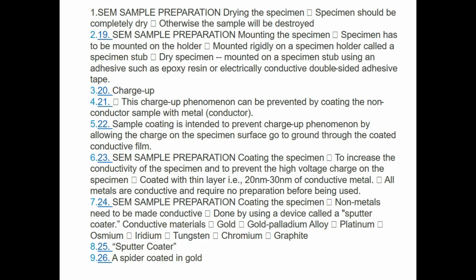Okay, and you can check what elements are placed inside that area, not an issue. Coming to biological samples and non-conductive elements, in biological samples it is very difficult. So what we have to do is give a coating, which is called sputtering. Most probably we use gold material to coat the biological samples so that the surface becomes conductive. By using that only we can go ahead, otherwise it is very difficult.